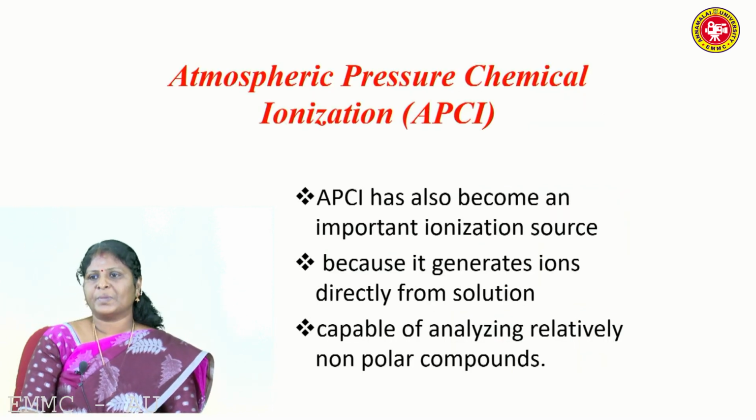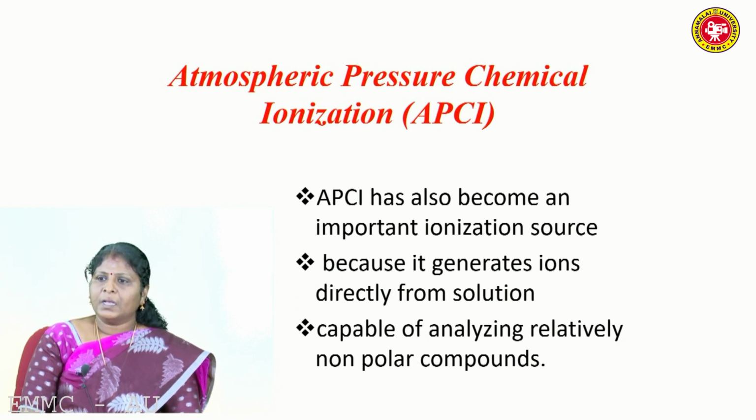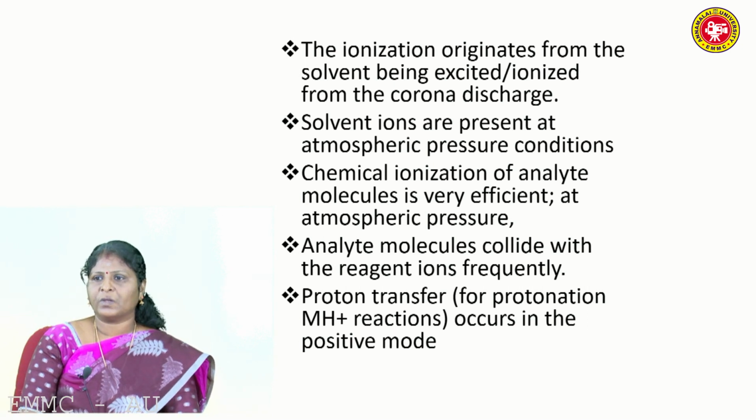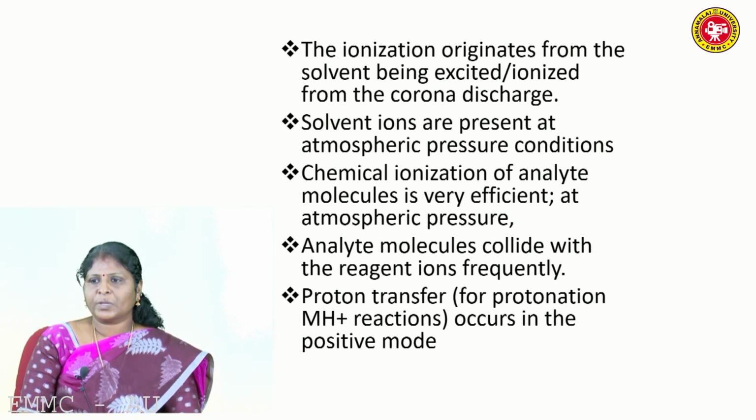Atmospheric pressure chemical ionization technique. APCI has also become an important ionization source because it generates ions directly from solution, like the electrospray ionization method. This is capable of analyzing relatively nonpolar compounds. The ionization originates from the solvent being excited and ionized by the corona discharge. Solvent ions are present at atmospheric pressure conditions. It's almost similar to chemical ionization of analyte molecules, and it's very efficient at atmospheric pressure.